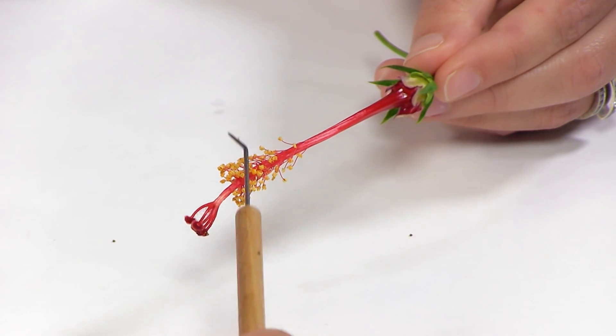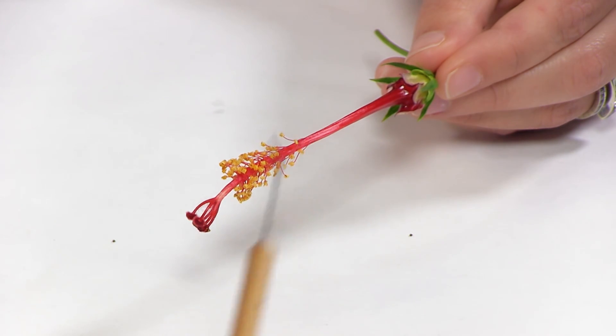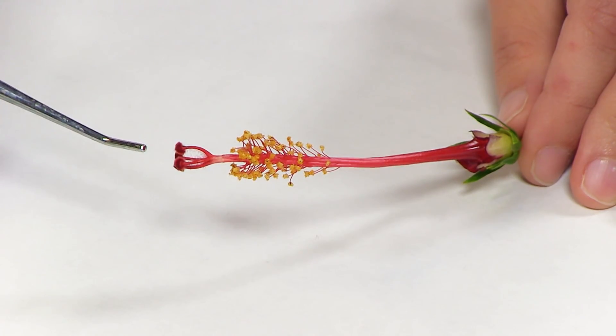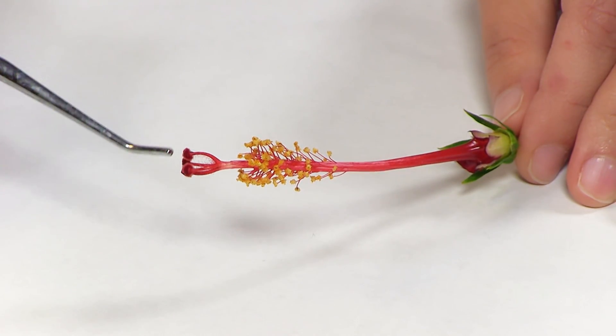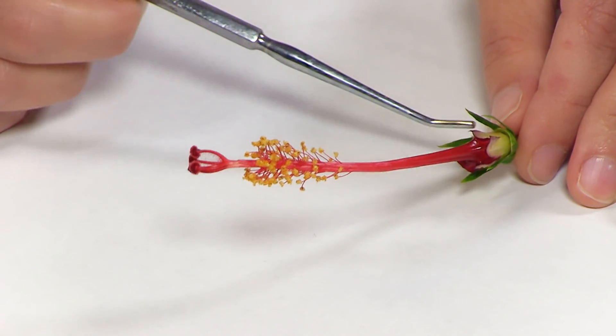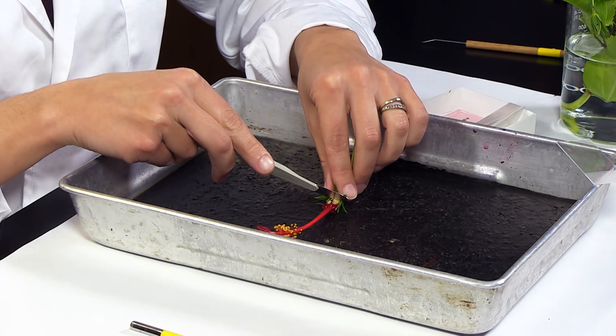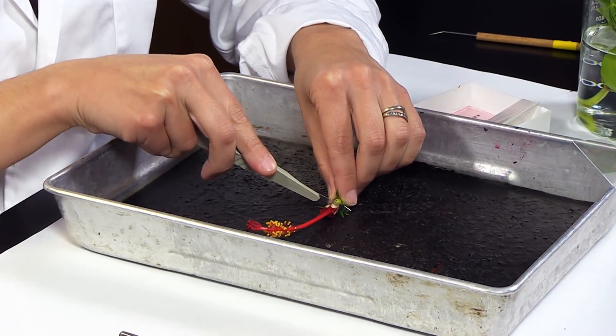Notice the male part of the flower, the stamen. It includes the anther and filament. Observe the female part of the flower, the carpel. The carpel consists of the stigma, style, and ovary.